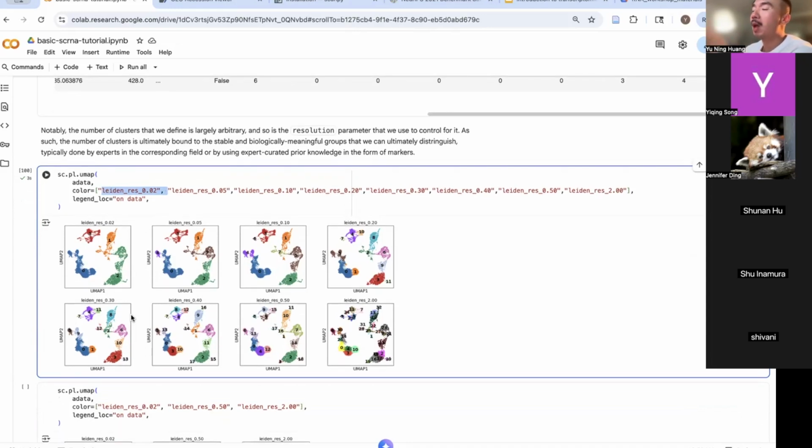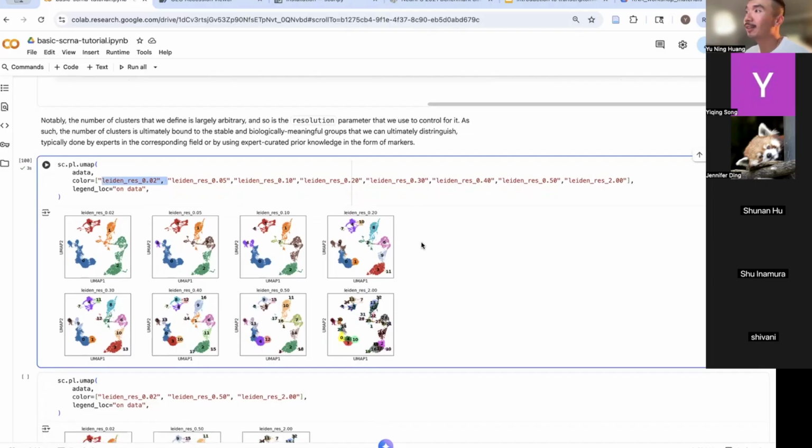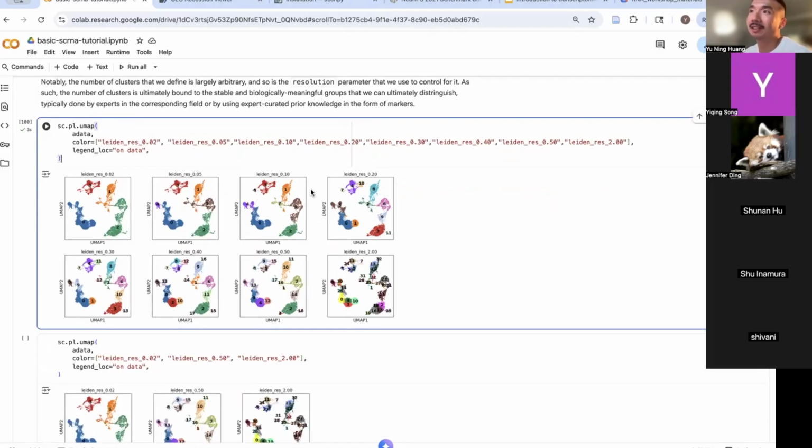But you can also play around, because if I wanted to separate them based on more detailed sub cell types, maybe I would try to increase the resolutions. And I think I brought this up last week. The only downside of increasing clusters is that everything will be messier, and some PIs just hate things complicated. But I feel like people should at least know how. So this is how we can visualize and then select what resolutions I want.